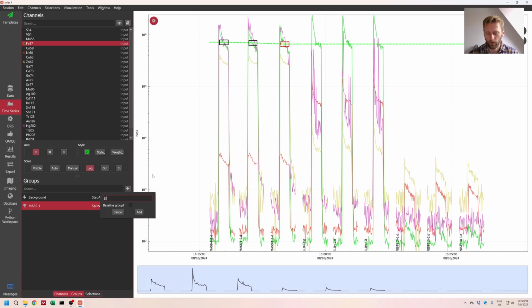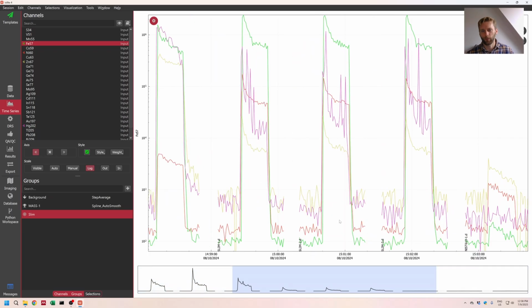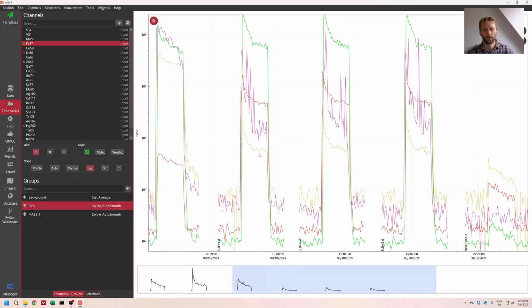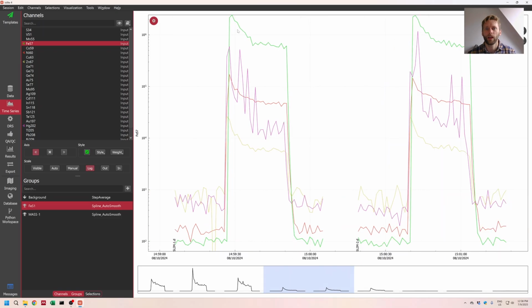This is called Slim. This standard in our lab is often called Slim, but its real name actually is FES1. Sometimes you'll have a peak that looks funny, like it's not nice and flat, and it's kind of up to you what you want to do. For standards, you generally want to include the entire peak, like that.